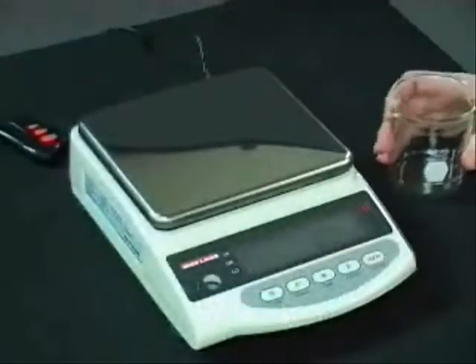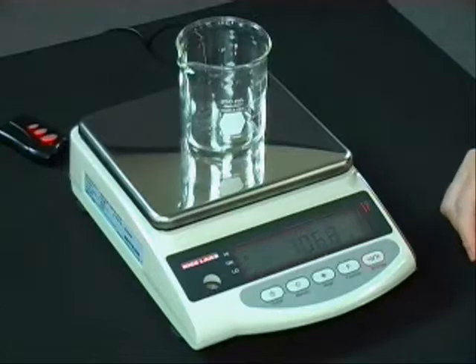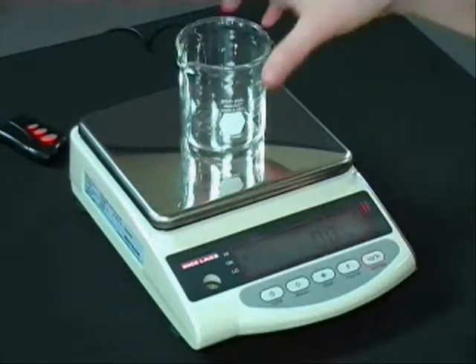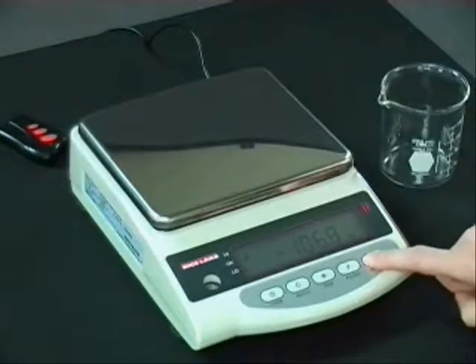Now we'll step up and do a demonstration on the balance itself. To weigh on the balance, all you have to do is put your container on — or what you're weighing — and it'll display the weight. To tare this container off, you simply push the tare button. The tare takes the value of your container away from what you're weighing, so you'll only show the net value of the product being weighed. Then remove the tare by pushing the tare button again.